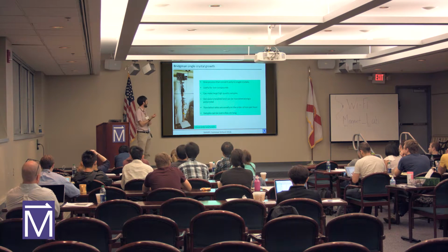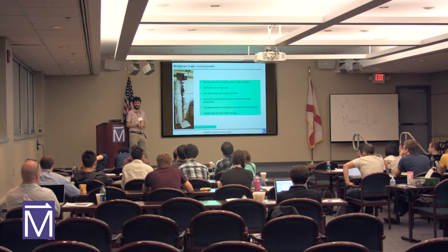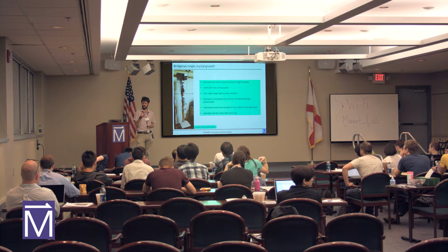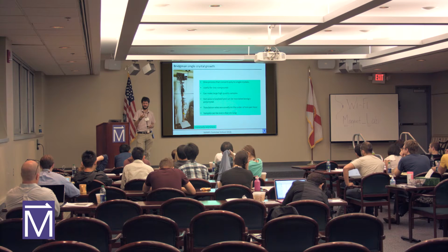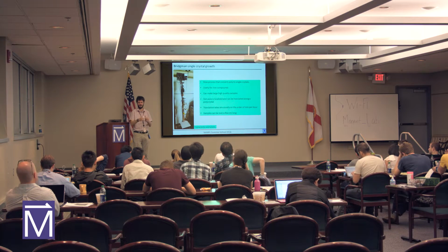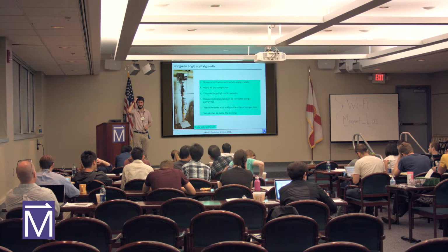Well, it depends. So you could do it in atmosphere, I guess, if you had the right material. I think it's more common to seal your material, for instance, in a quartz tube. You can buy crucibles, for instance, that come to a point. So you could put an alumina crucible inside of a sealed quartz tube. And if you're good, then maybe you can even make a little loop of quartz at the top so that you can put a hook in there. But there's other ways to hold the ampoule if you can't do that.